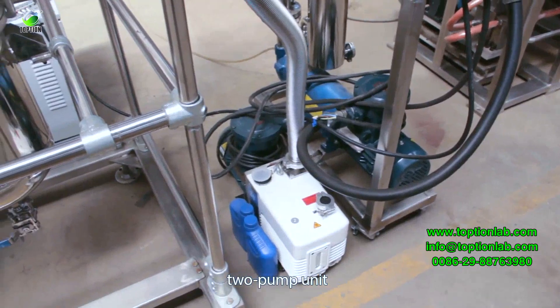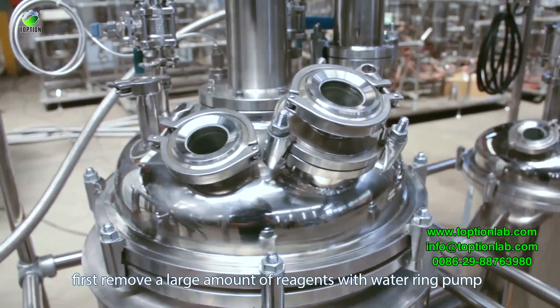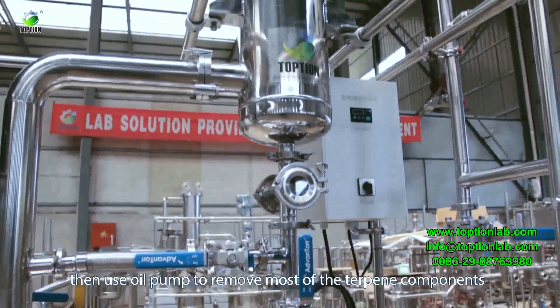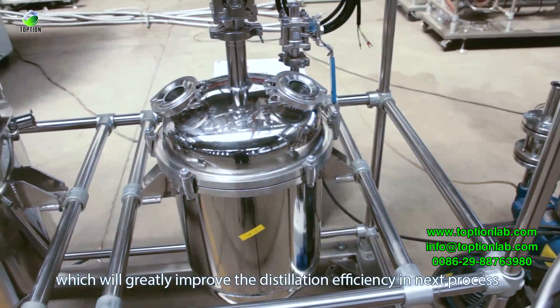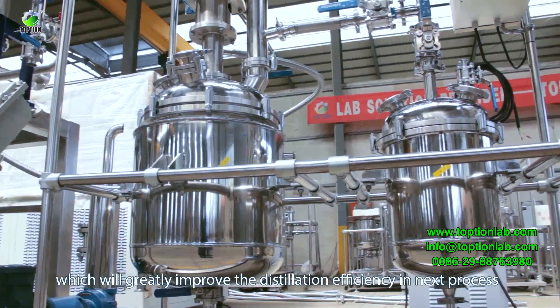The decarboxylation reactor converts CBD-A into CBD. A two-pump unit is used: first, a water ring pump removes a large amount of reagents, then an oil pump removes most of the terpene components, which greatly improves distillation efficiency in the next process.